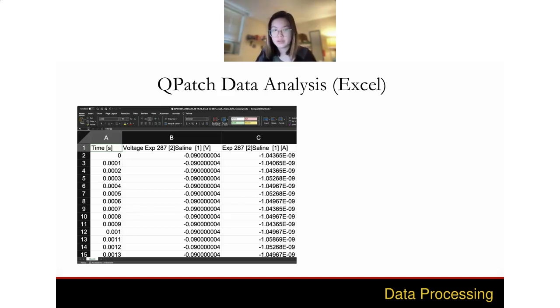So basically our experimental design. And then this third column would be the data we collected. It represents the current. So this is an Excel file. Most of us have used Excel files in our day-to-day. So it's very accessible to the average student, and people have Excel on their Chromebooks, on their tablets. They have Excel on their Windows computers. They have it on their Mac. So it's very easy to use.